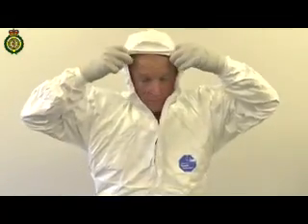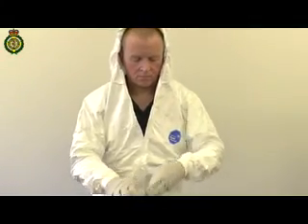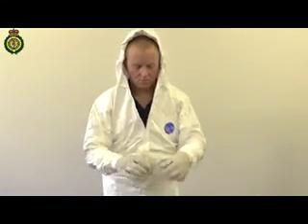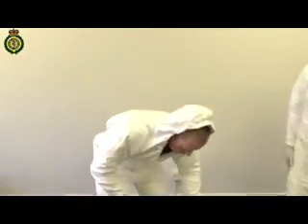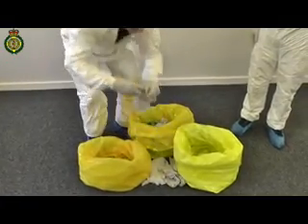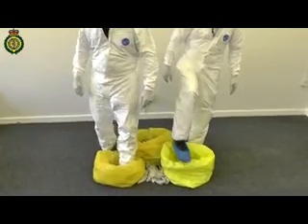To remove your overall, with a clean pair of outer gloves on, undo the top part of the zip to halfway down the chest. Tilt your head forward. Pinch the hood and turn it backwards and inside out part way across your head to expose the clean inside of the hood. Once again, change your outer gloves and replace with another clean pair. Then step into the double bag.